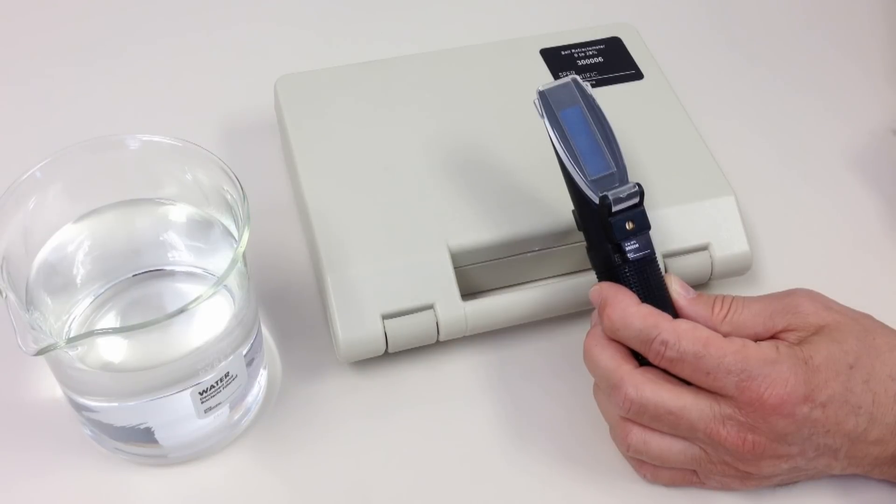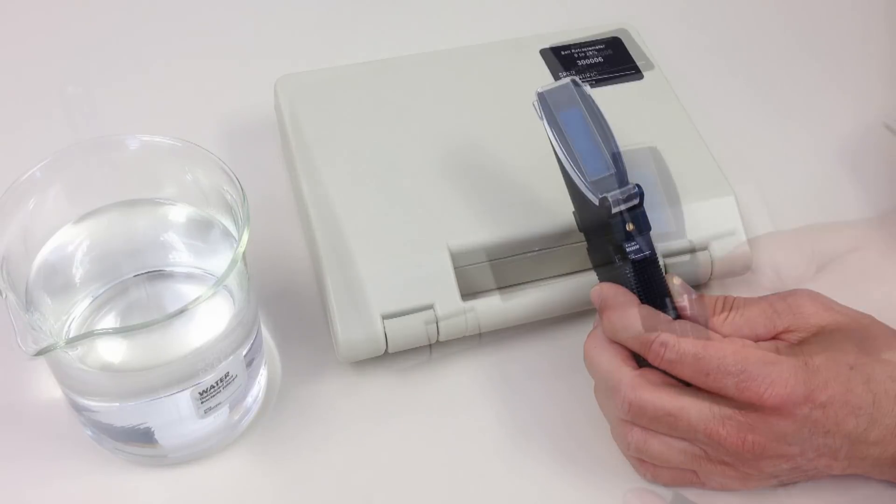Spear Scientific Portable Refractometers work in ambient light with no battery or other power source necessary. With reasonable care, their reliability, precision and optical performance will last forever. They're easily portable and convenient for use in labs, on production lines or in the field.